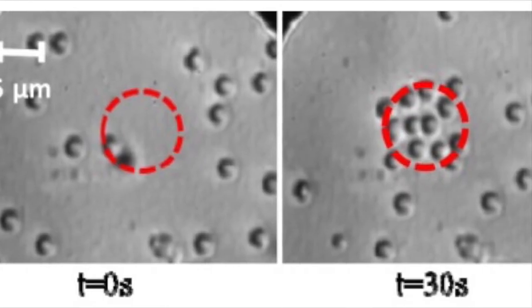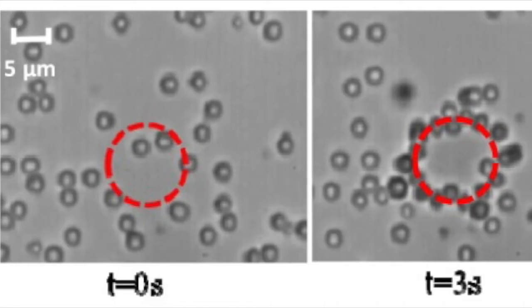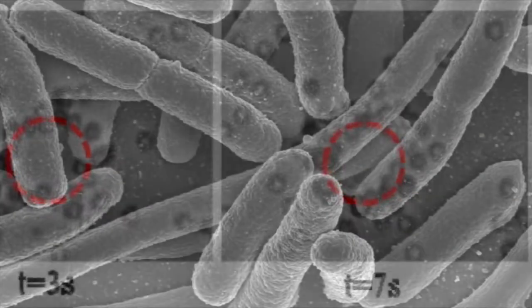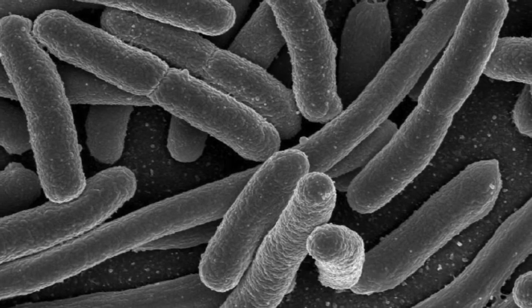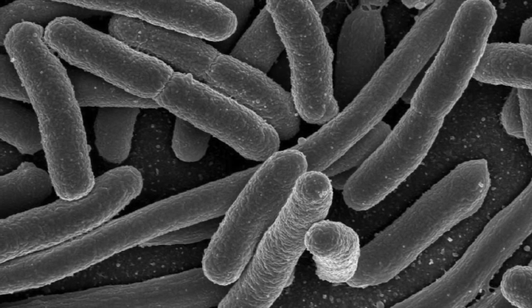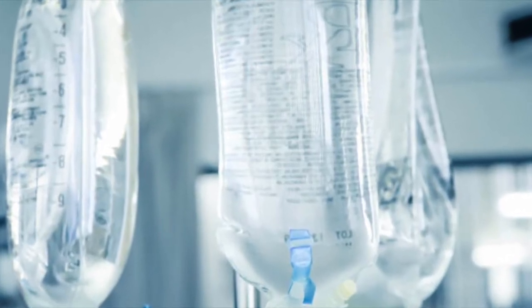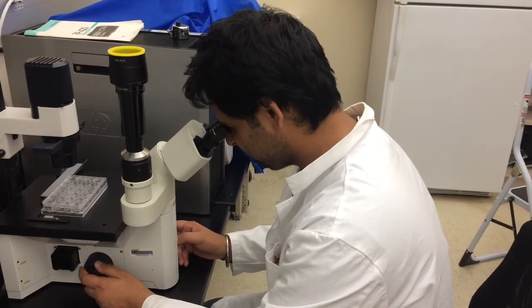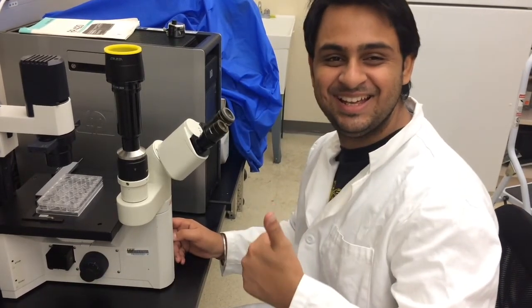The laser light creates convective currents that are expected to trap and move particles, and in this way we hope to assist in the diffusion process of bacteria in blood samples. The output buffer stream will be analyzed for bacterial presence, which should contain a high density of bacteria. Once the bacterial species is known, better antibiotics and treatment can be applied for treating bacteremia and sepsis. In the future, we hope to develop a prototype that can physically demonstrate the features described here.